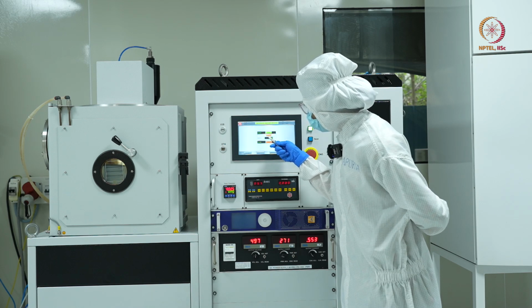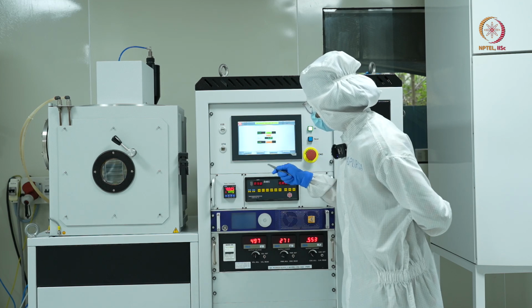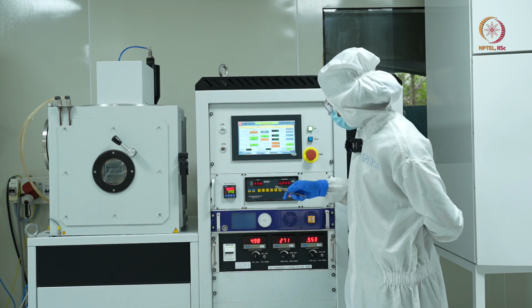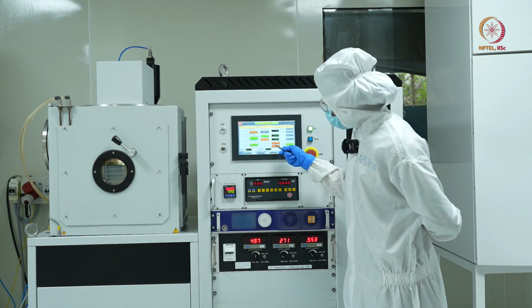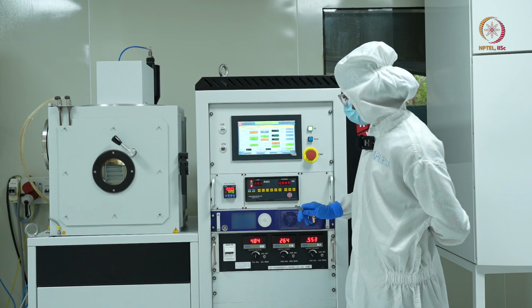So here I have enabled the rotary drive and I am setting the RPM to 10 RPM. And once again I'll go back to the source control and I'll open the shutter. And here I'll press start.